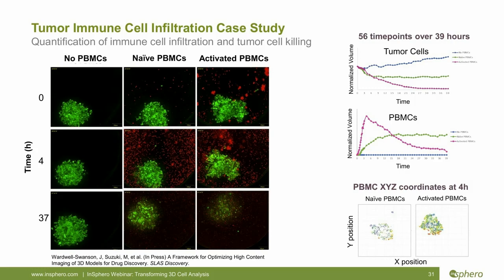The sharp peak in the activated condition suggests that spheroid-associated PBMCs are either increased in their migration into the spheroid or that a rapid expansion of activated immune cells is occurring within the tumor spheroid. The subsequent slow decrease in spheroid-associated PBMC number corresponds then to the destruction of the spheroid.